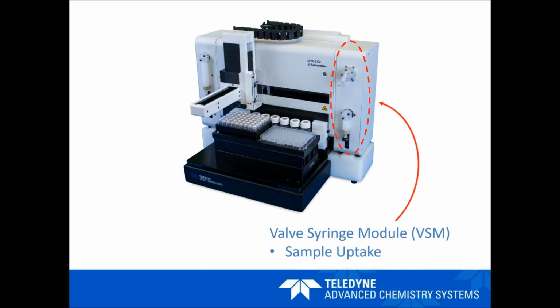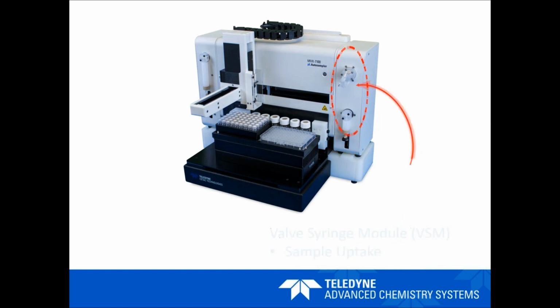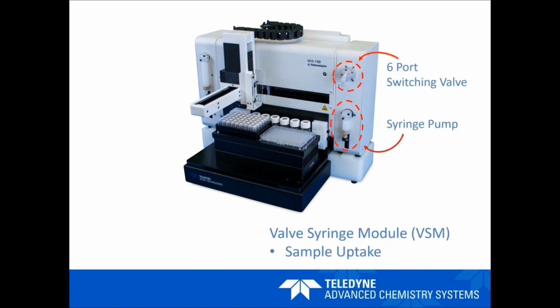Now this module is responsible for pulling your sample up from a sample vial and putting it onto a sample loop. On that module, you've got a short syringe pump with a syringe on it. This is a 1.25 milliliter PFA syringe with PEEK fittings, and that marries up with a CTFE switching valve. That pump is going to be responsible for pulling your sample out of a vial and onto your sample loop. That sample loop is mounted to a 6-port switching valve, which is above there. So the first thing you'll do is take your sample and position it onto that loop.